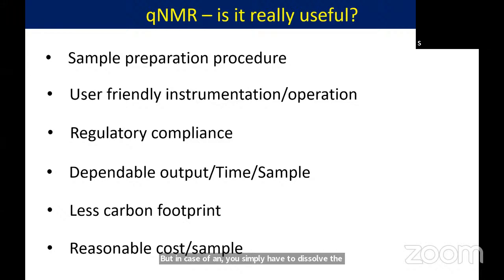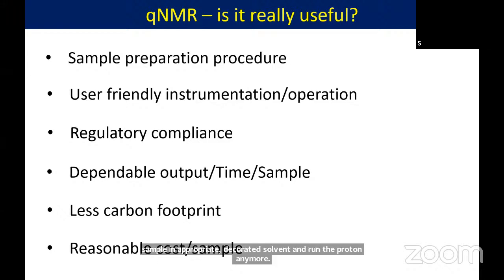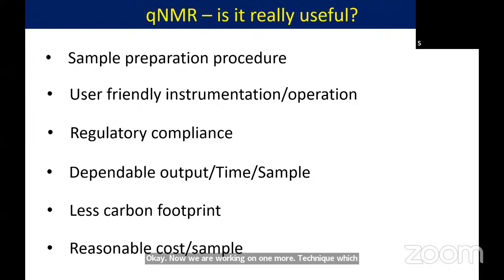Now we are working on one more technique which can be used as a quantitative technique. That is what we call DOSY. It can help you even furthermore. That also can be completed within half an hour to 1 hour. So with this, I'll conclude my presentation.